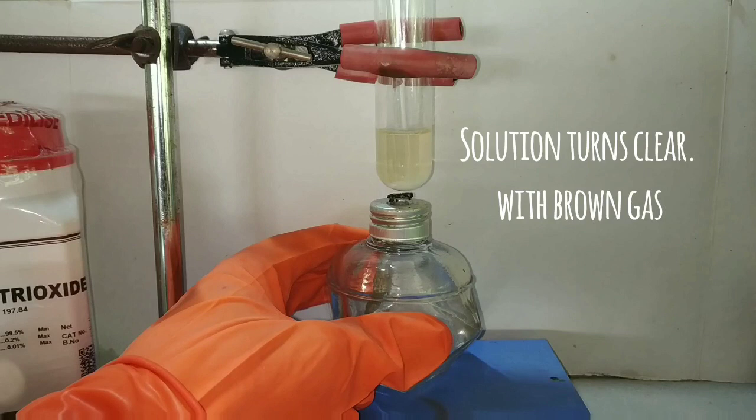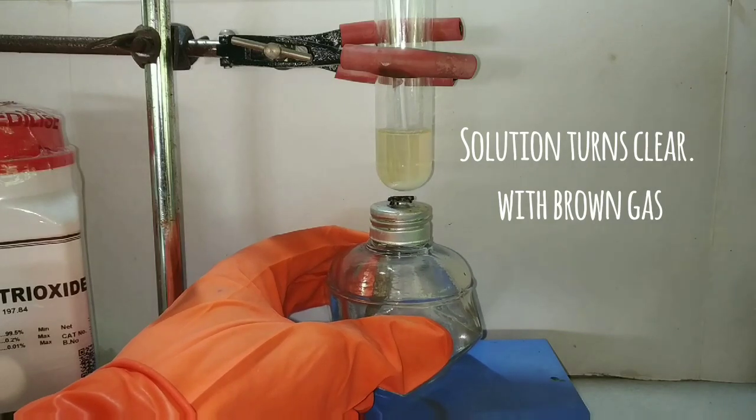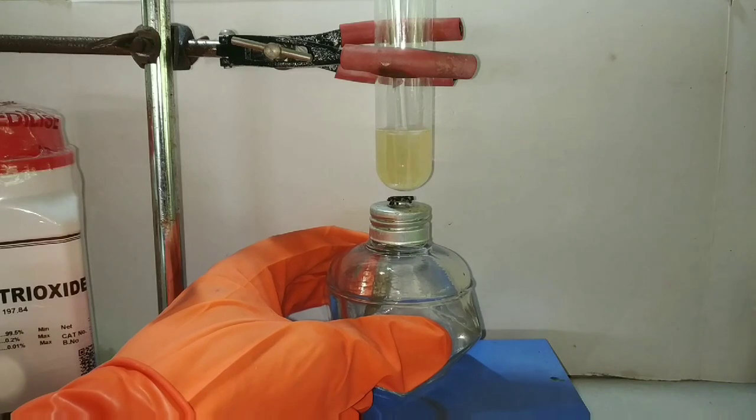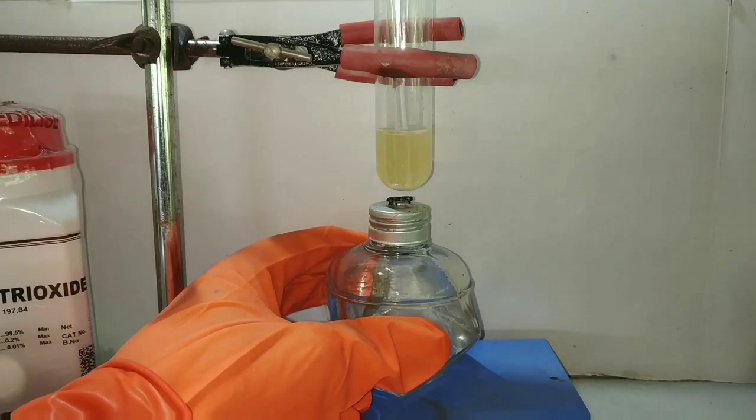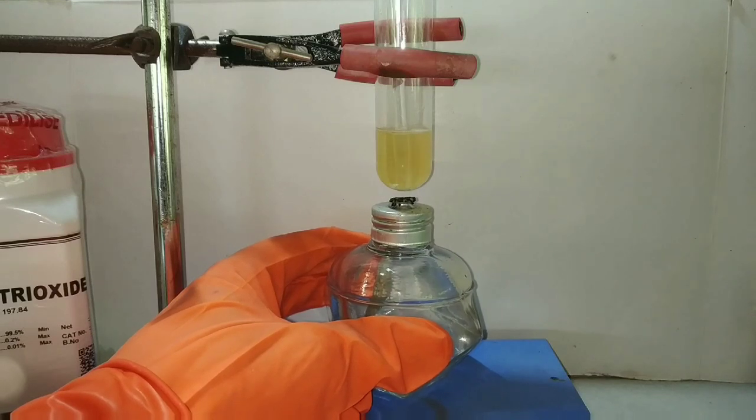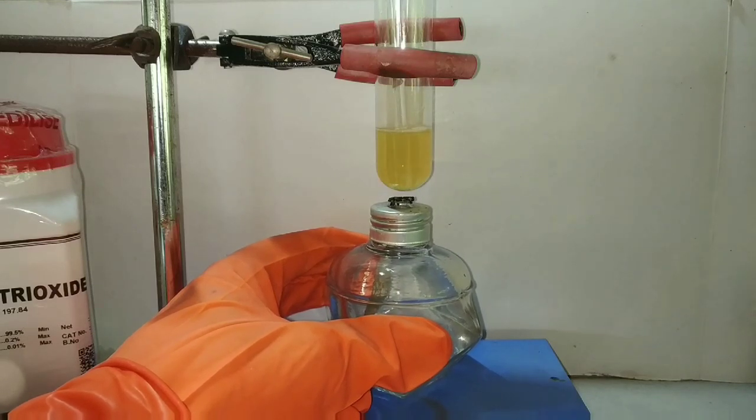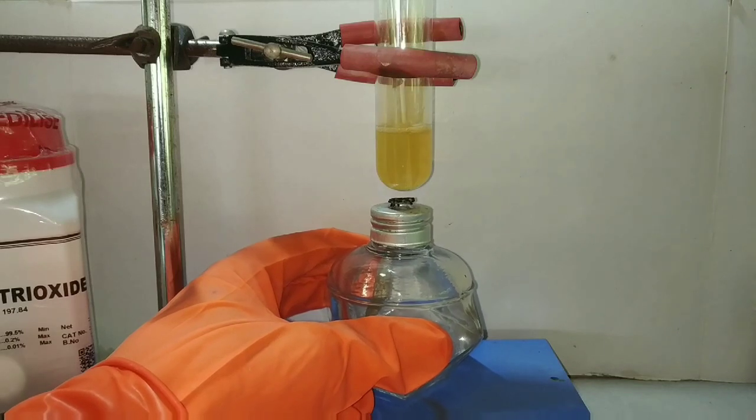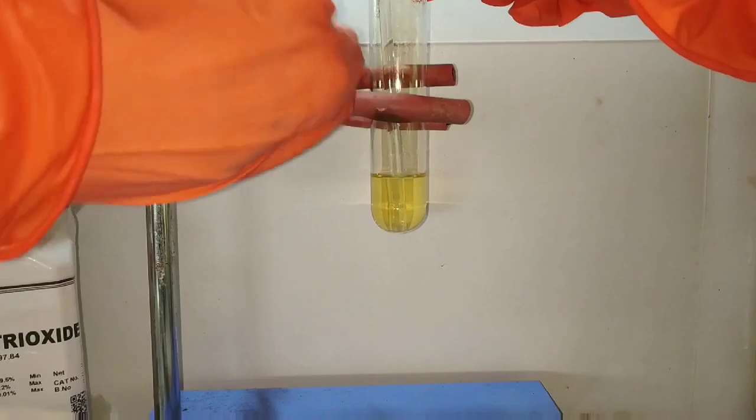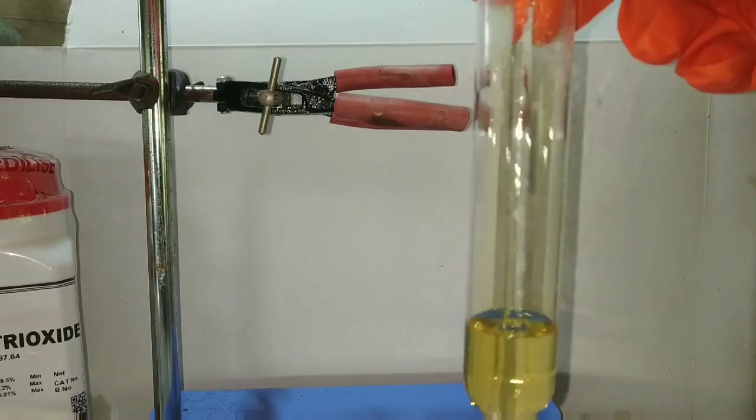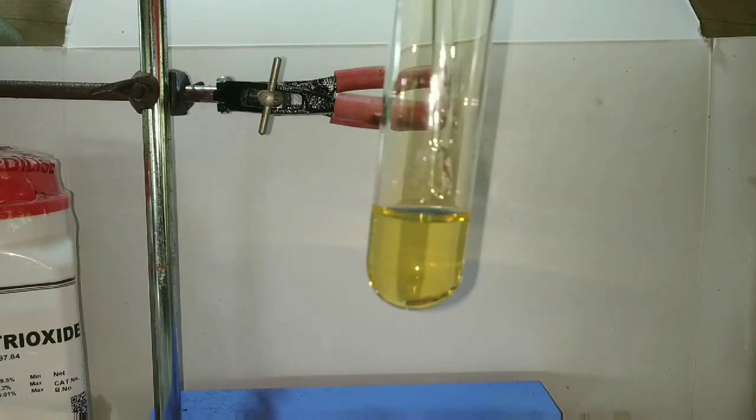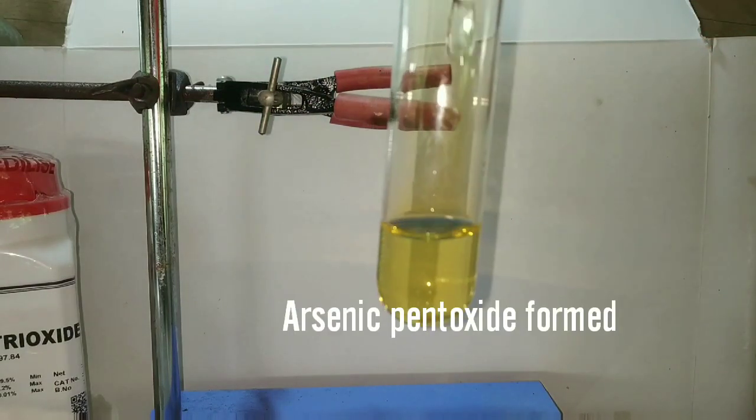You can see that on heating and mixing the contents, the solution has turned clear and there is evolution of a brown gas and the solution is turning brown, which indicates that the oxidation has taken place. The compound has been converted to arsenic pentoxide and nitric acid is reduced and nitrogen dioxide gas is being formed.